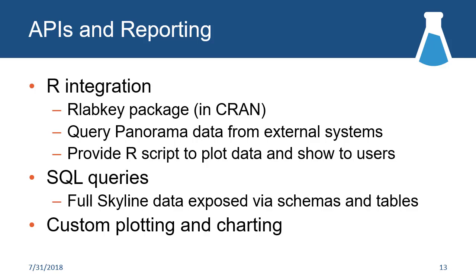And then we have the ability to just within Panorama write queries using SQL for those who are familiar with relational databases already as a way to report and aggregate over that data. Or you can do just plotting and charting, bar plots, line plots, box plots, etc. within Panorama without having to write any script at all.